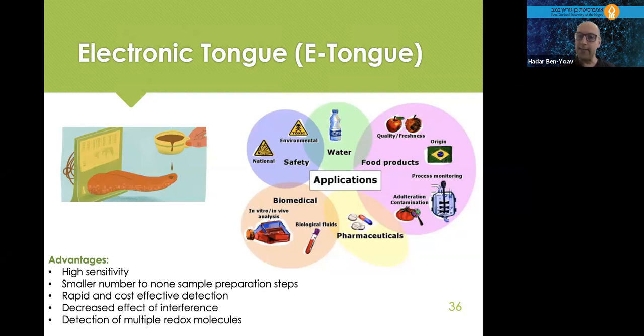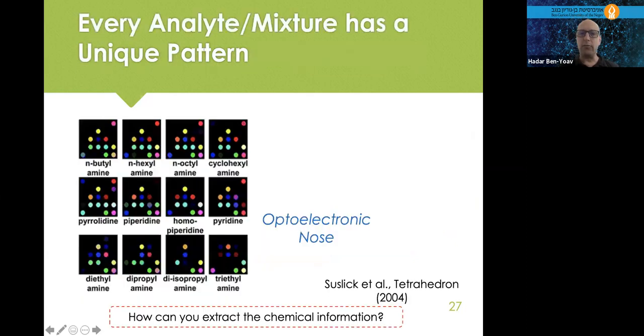And very nicely, we can use the same signal and build models. This kind of model can predict for multiple molecules or multiple different analytes, such as we saw before, that the sensor was able to detect different types of analytes, not only one of them.